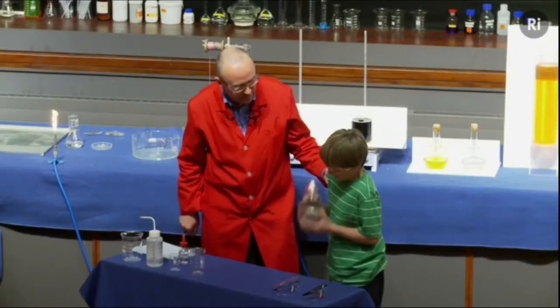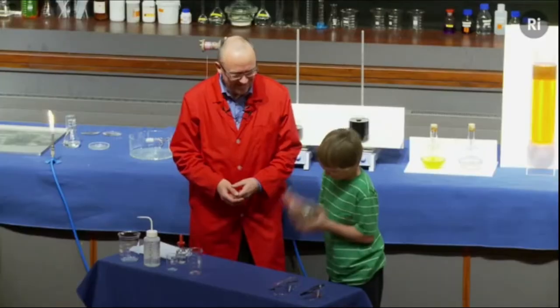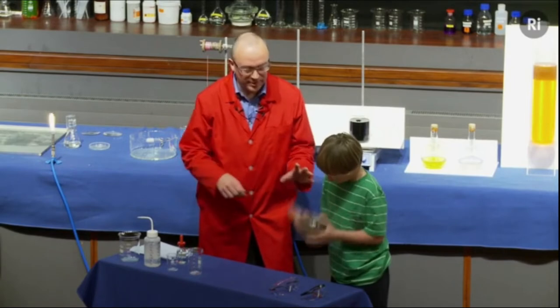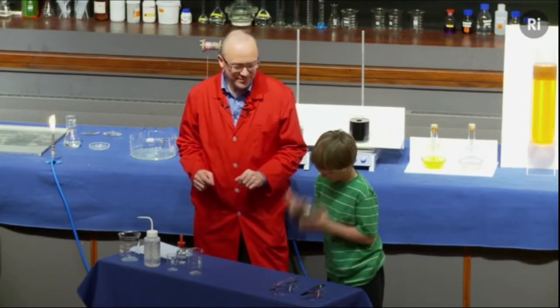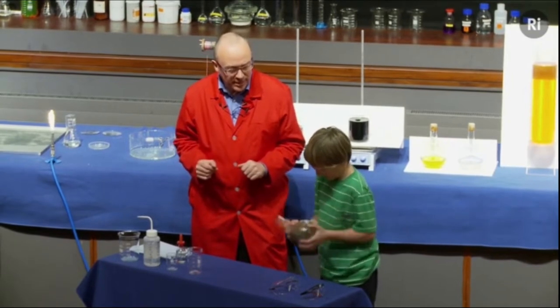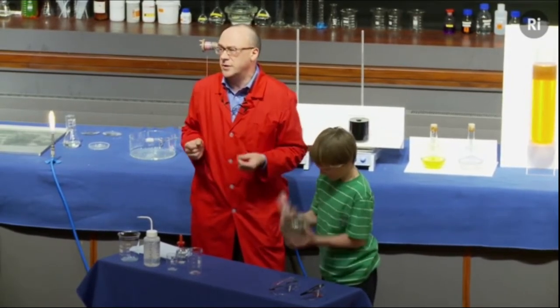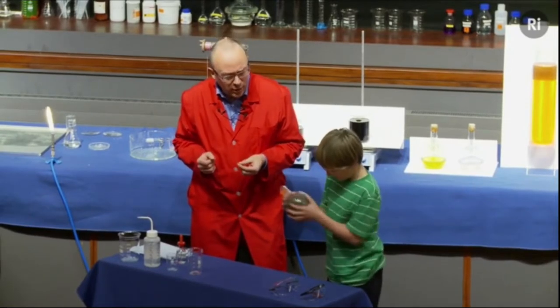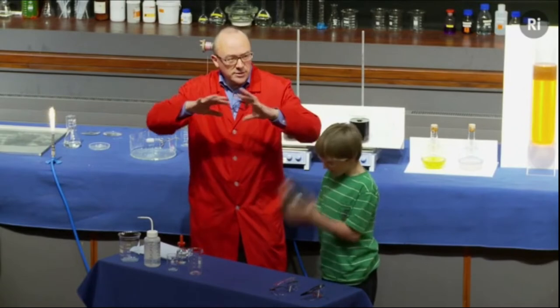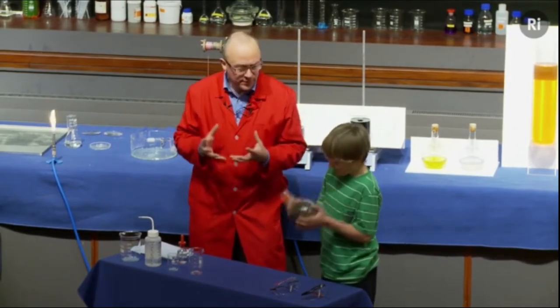This takes about three quarters of an hour. Is that okay? It does actually take a minute or two, but the harder you shake, the better it works. So keep shaking. Don't drop it, though. Okay. So silver metal is being formed sort of atom by atom, and you can see it's all going quite black. That's because very finely divided silver is actually black in colour. What we're hoping is going to happen over the next minute or so is that those particles of silver will start to stick to the walls of the flask.